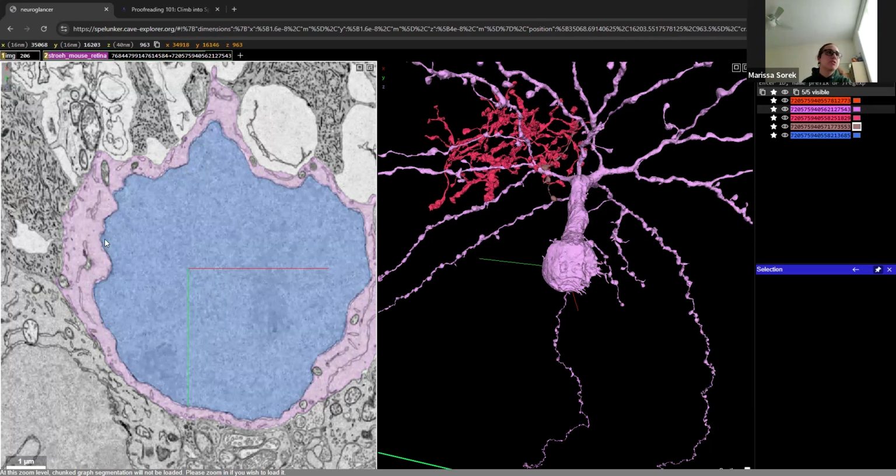We're trying to keep the nuclei segment IDs static, not dynamically changing, because every time we make an edit, that's going to change the segment ID. So that's the current hope, not having those merged in with the soma membrane.